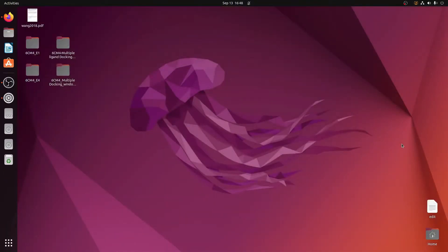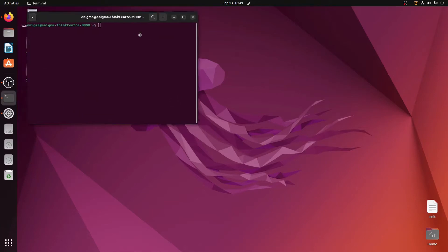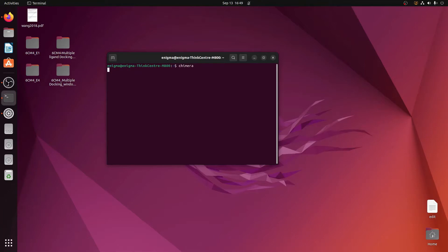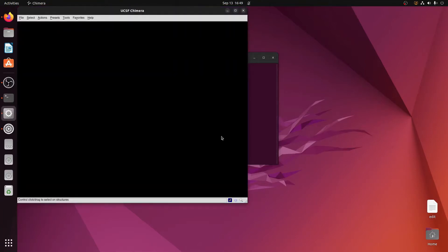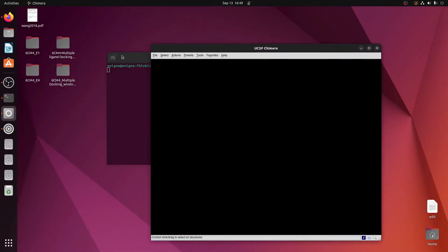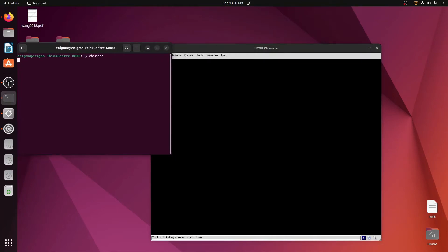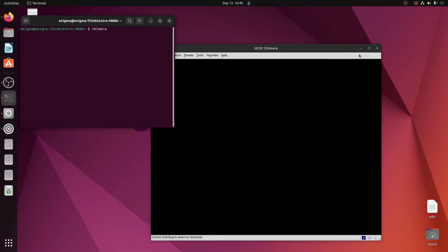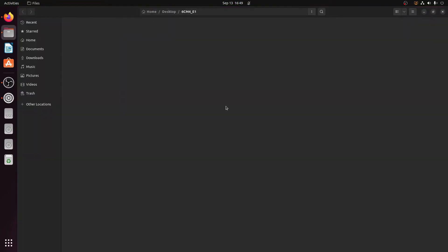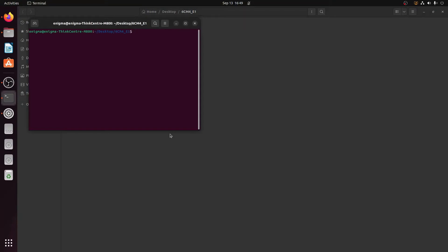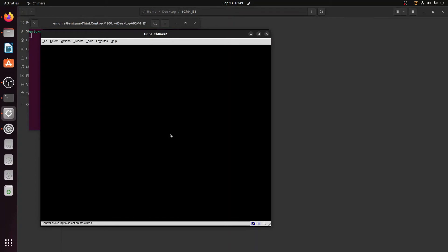We have created an alias inside the .bashrc file for UCSF Chimera. Now wherever you are, if you open a terminal with Ctrl+Alt+T and simply type 'chimera' and hit Enter, Chimera will open. This will help make your work a little faster, because when you are working in Linux in the terminal it does not matter which folder you are in. You can go to any folder, open a terminal there, type 'chimera', and it will open. Wherever you are working in the Linux environment, with the help of this alias you can simply open Chimera.